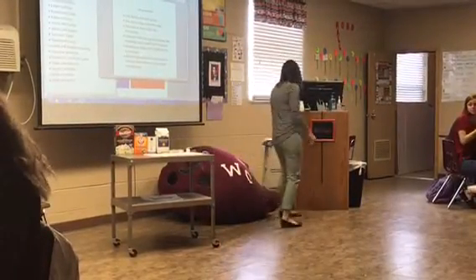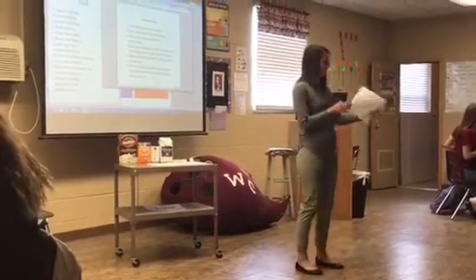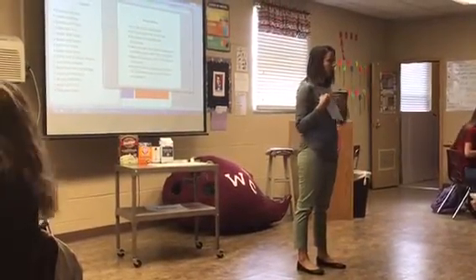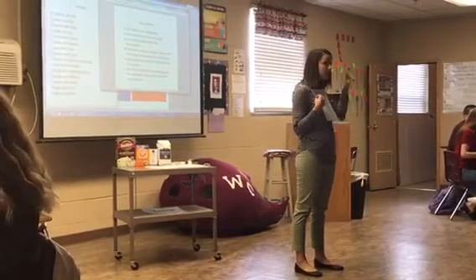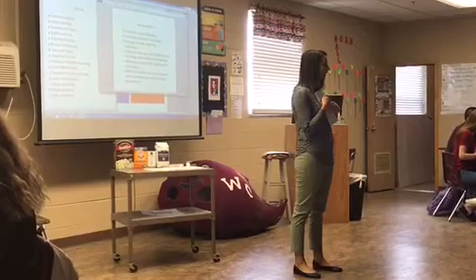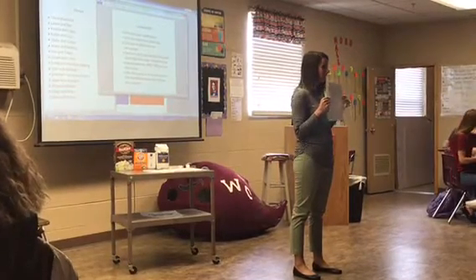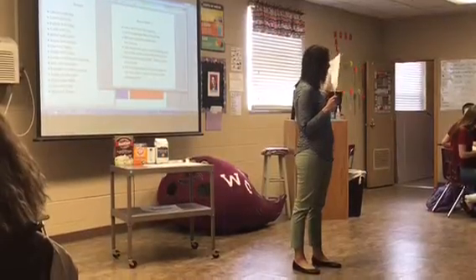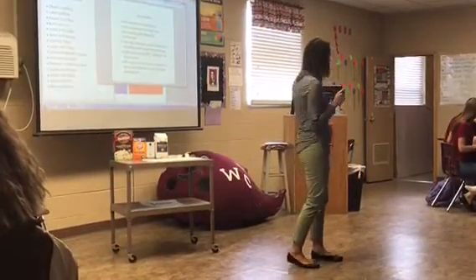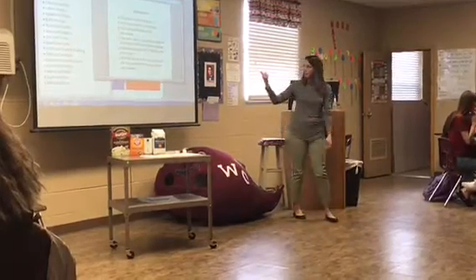And everyone go ahead and turn the lab sheet over. Look at the back. You're going to make observations about the mystery residue and look at it under the microscope and then match it up with the other 6 pieces of evidence. Got it? And then I've listed some group jobs and rules.